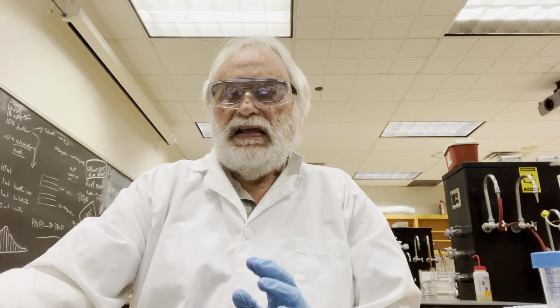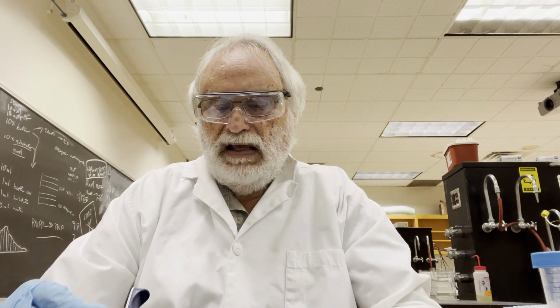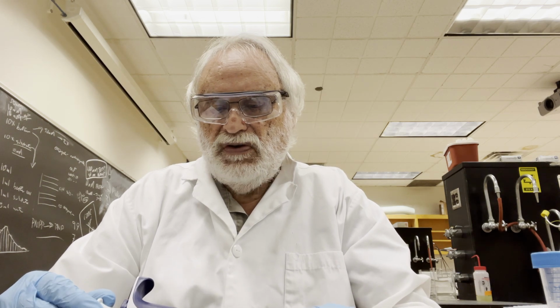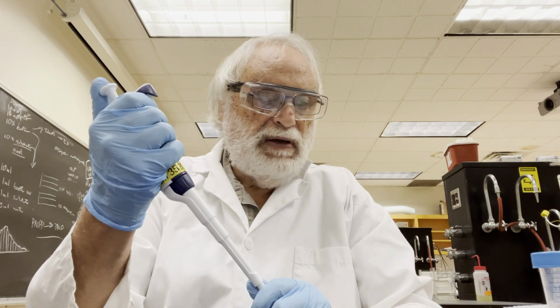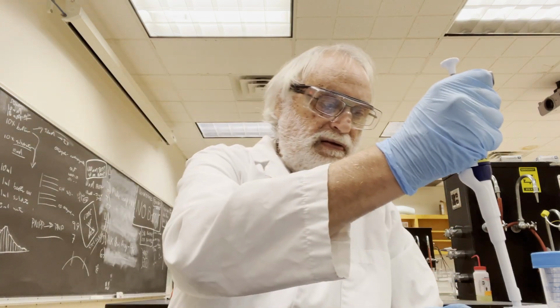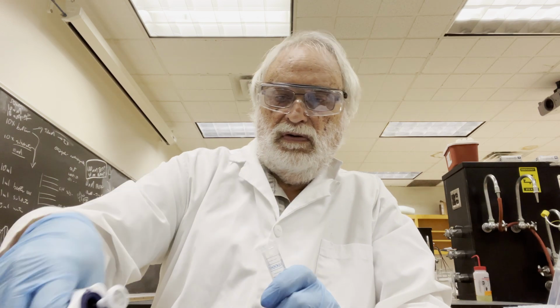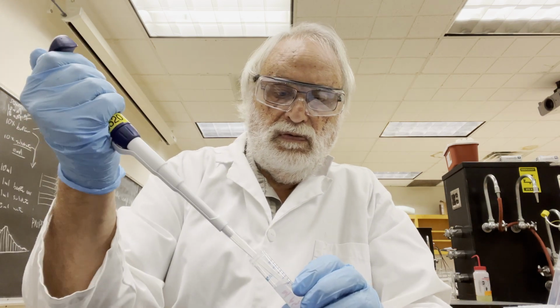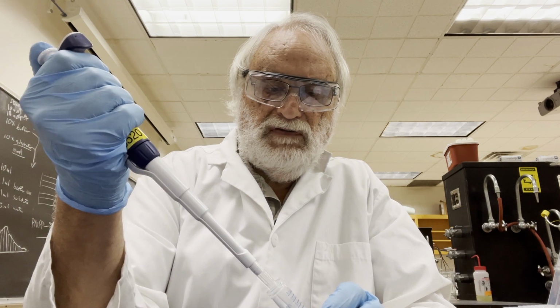The next step is we need to make our substrate. And unfortunately, we kind of have to do this twice because of volume constraints. But I will go ahead and add one milliliter to each of 10 tubes.